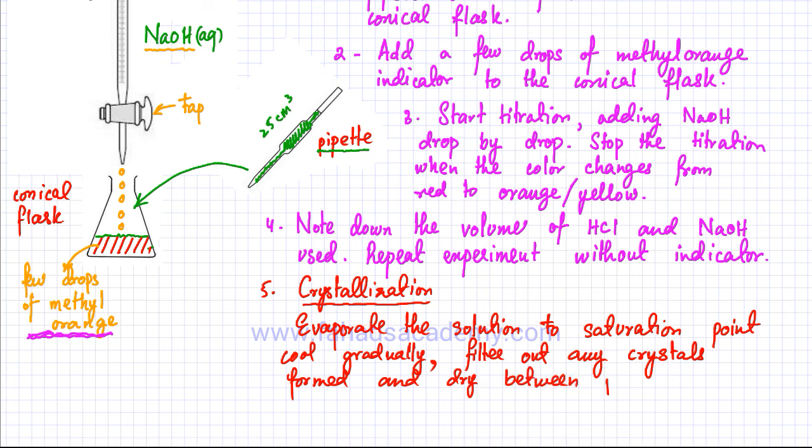Between pieces of filter paper. So that is your last step.